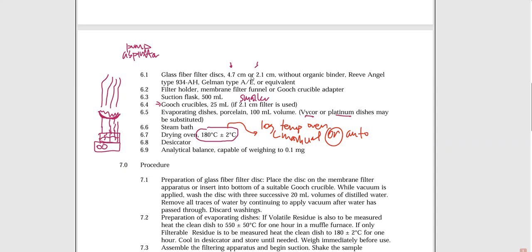So I can get a temperature sensor, and that temperature sensor can constantly monitor the temperature throughout the course of a day. And then that temperature is going to be sent to some type of computer software that is logging that information over the course of a day. And then day after day after day, it will save it.